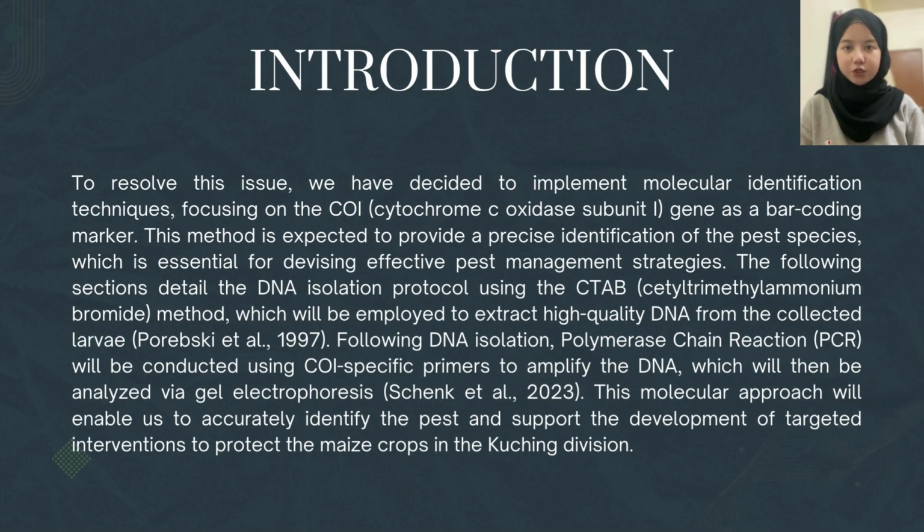To resolve this issue, we have decided to implement a molecular identification technique, focusing on the COI gene as a barcoding marker. This method is expected to provide a precise identification of the pest species, which is essential for devising effective pest management strategies. The following section details the DNA isolation protocol using the CTAB method, which will be employed to extract high-quality DNA from the collected larvae.